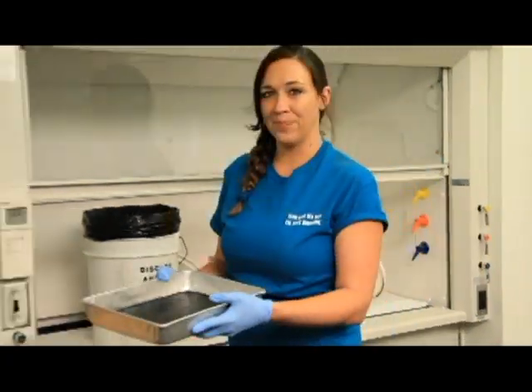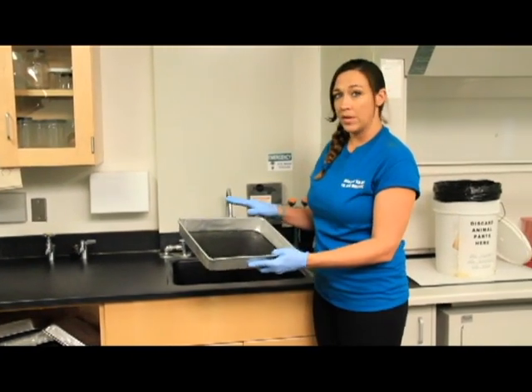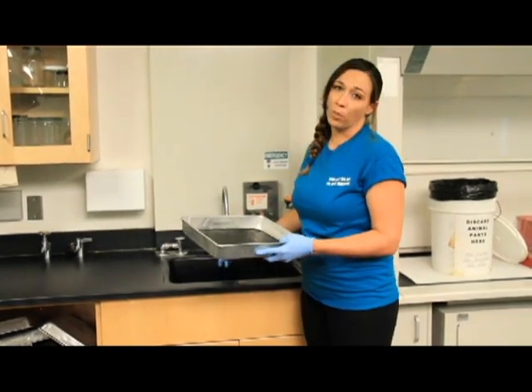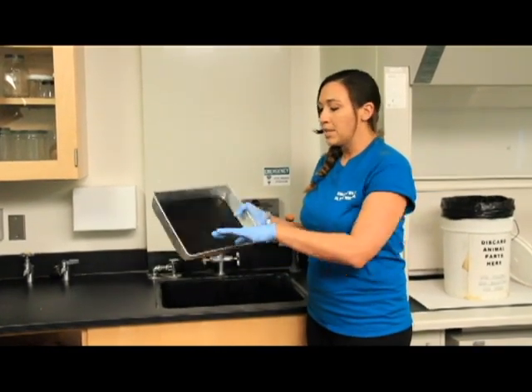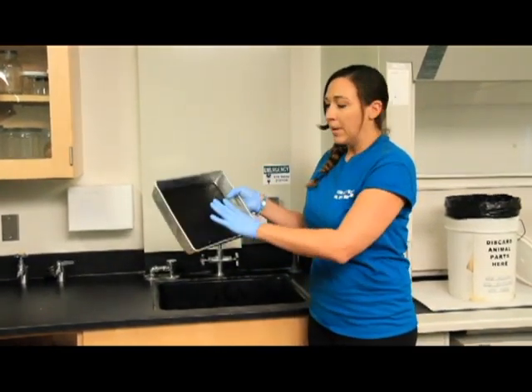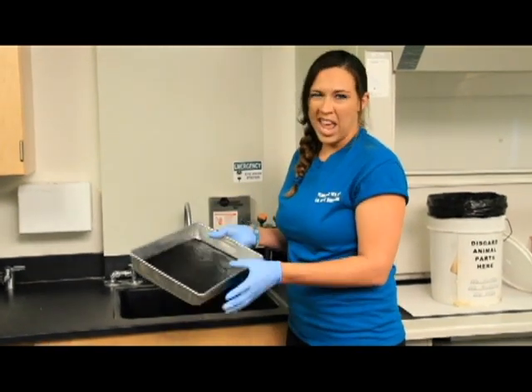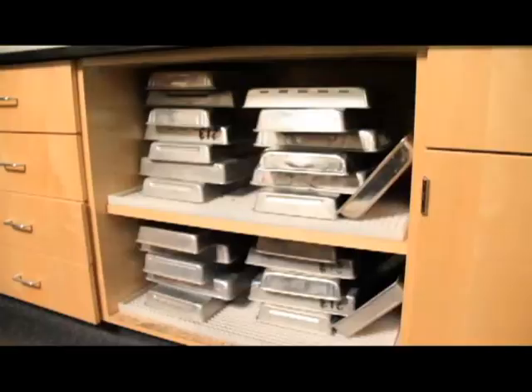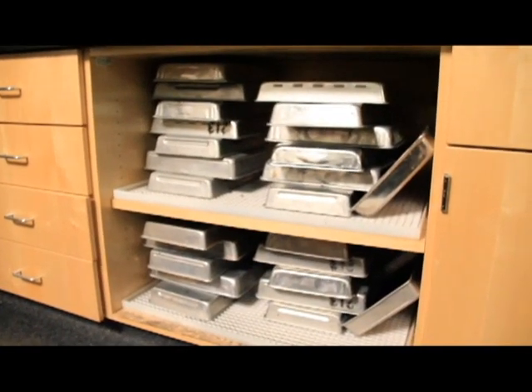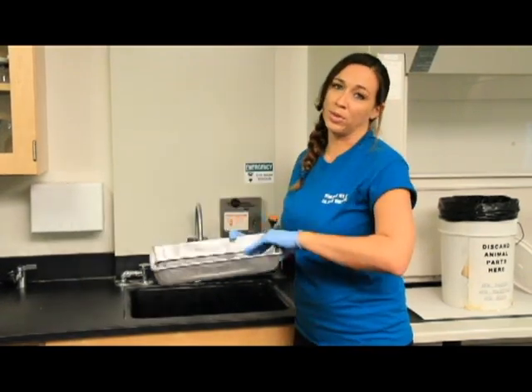The final step is where we come over here to the sink, and now with our tray with no pig bits on it, we're going to rinse with soap and water and then stack neatly so that everything can dry. We never want to stack the trays right on top of each other because this is wax, and if it's not able to breathe, it won't be able to dry. And then the back of the classroom is going to smell really nasty after a couple of weeks. So you want to make sure that they're all stacked so they can aerate. If this one's stacked here, that air can flow in and they will be able to properly dry.